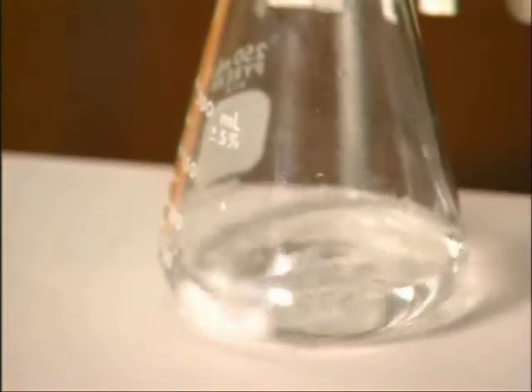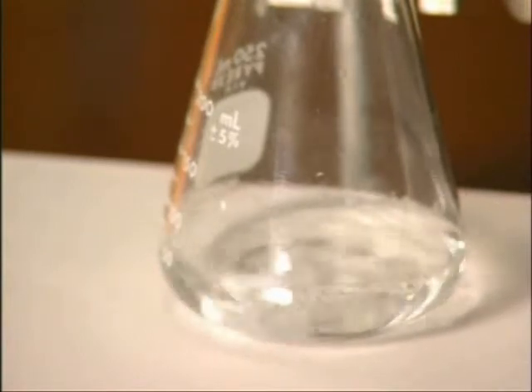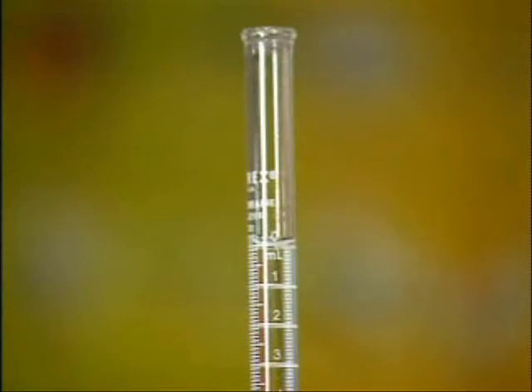Two drops of indicator dye are added to the acidic solution. This indicator dye is clear in acidic solution and pink in basic solution. The burette is filled with a sodium hydroxide solution of known strength and an initial reading is taken.